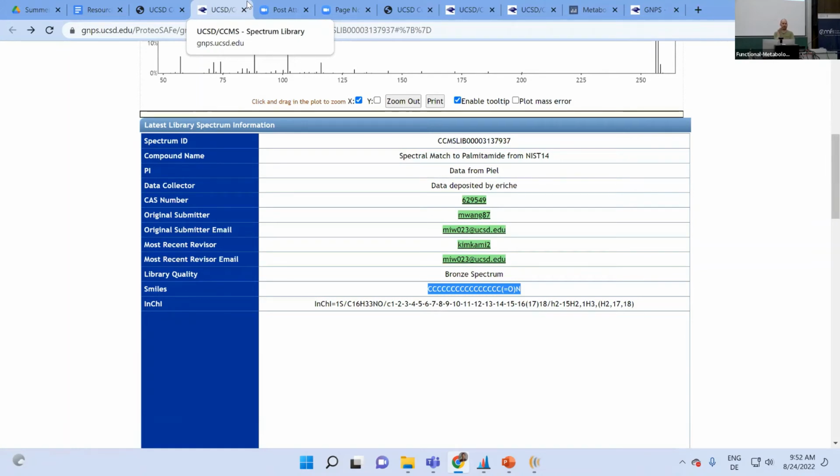So now if I hear that you found cocaine, I mean, it's funny too, but it's good because we know that this was an authentic standard we added, right? So now I want to make sure that my settings find that, and if not, I may want to tweak them till I find it. And then if you have something that should be connected, let's say benzoylecgonine, which is a metabolite of it, you can test, okay, is this actually connected in the network?